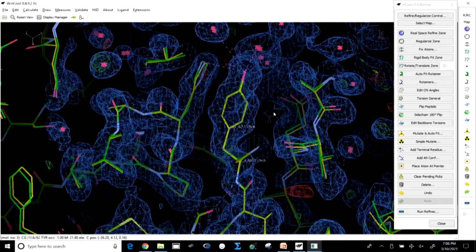One of them I could show you is mutation. So, what have we learned now? We have learned how to load the PDB file, we have learned how to load the electron density map, we have seen the difference in the map. When it is normal, it shows blue color, when it is wrong, it has either red color or green color. When something has to be put somewhere but people have not modeled it, it will be green. When they model it, but it should not be modeled there, they would get red color, right.